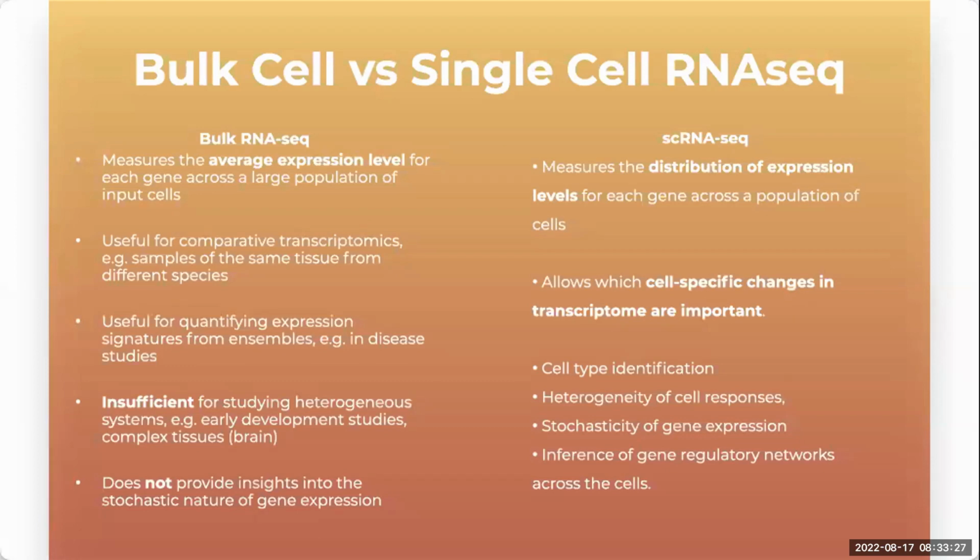But on the other hand, single cell RNA-seq analysis in itself offers ways to remove failed libraries, based on the percent of reads mapped, based on the percentage of the mitochondrial genome present, and based on the presence of different marker genes, which we will discuss in detail in the upcoming slides. So these advantages, together with the fact that we will get resolution of the expression pattern for each and every cell, make single cell transcriptomics a very enticing research field.